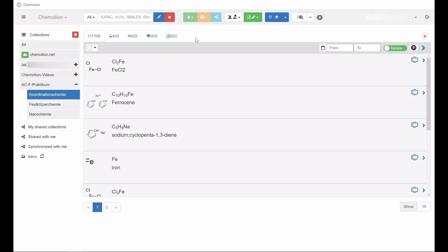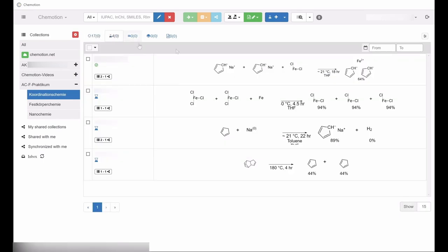This video will briefly present how to share or synchronize content from the Chemotion ELN with other people. Content which has been created in the electronic laboratory journal Chemotion ELN, such as chemical compounds or reactions, can be made available to others.